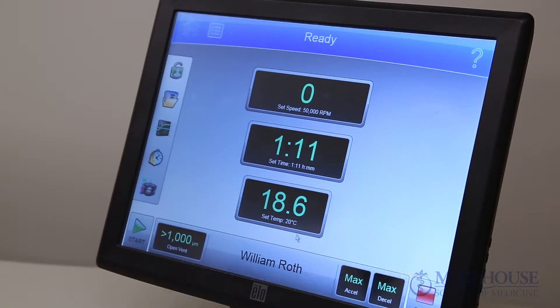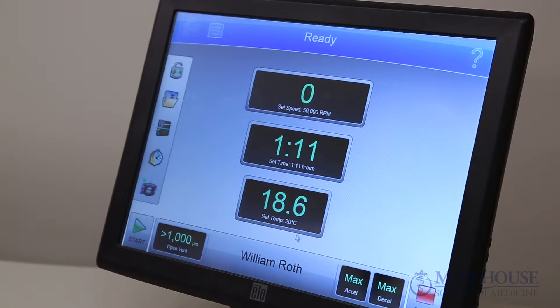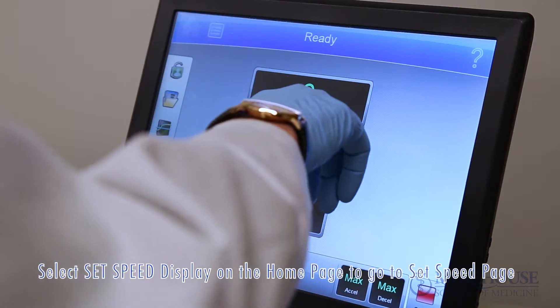Start on the home page. The banner at the top of the screen will be blue to indicate ready status. Select the set speed display button on the home page to go to the set speed page.